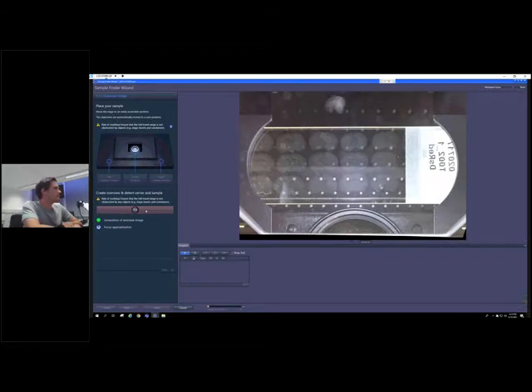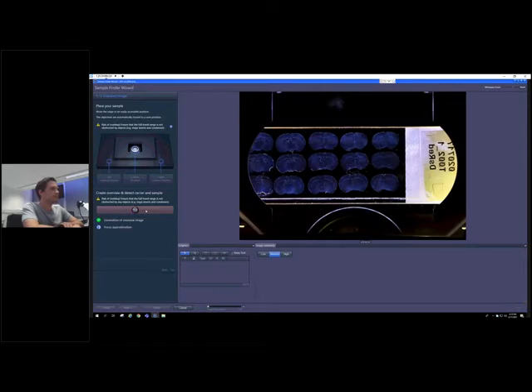And what you can see now is that there are several images being acquired with different kinds of illumination, with the reflected light illumination, plus a composite dark field contrast image, which is based on the 128 LEDs in the back of the condenser. And this is now running fully automatically, and the neural nets that are integrated in the AI sample finder will do several jobs.